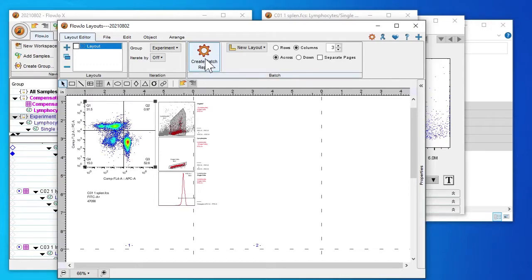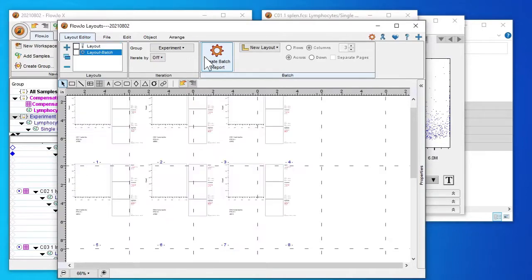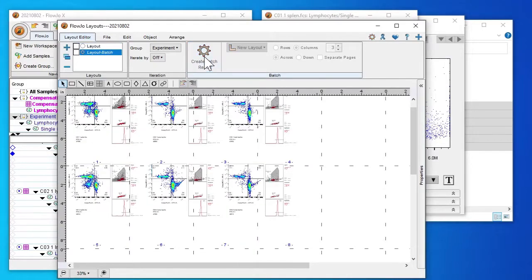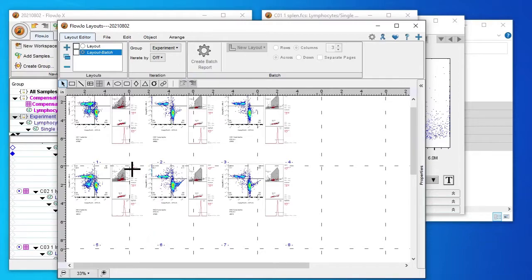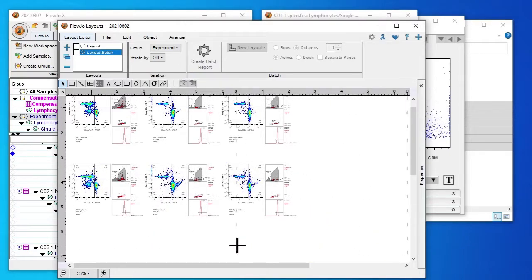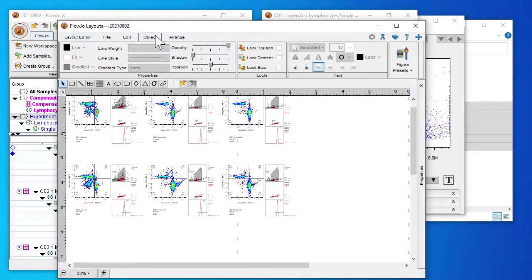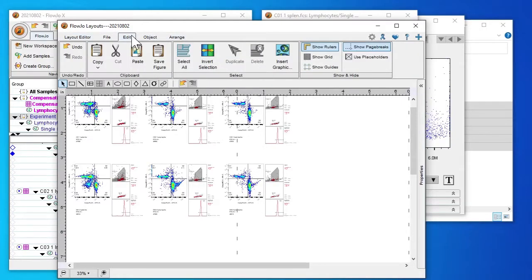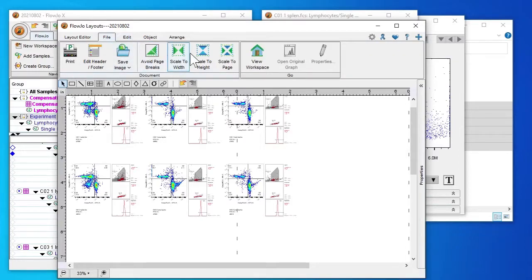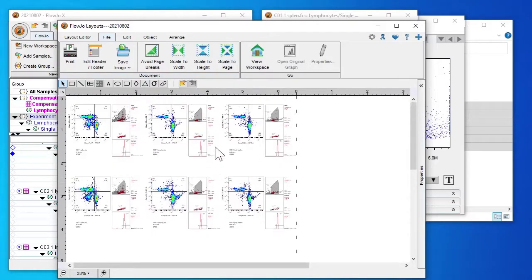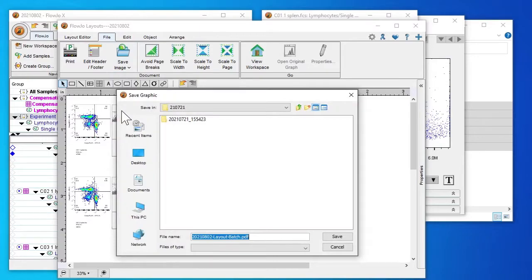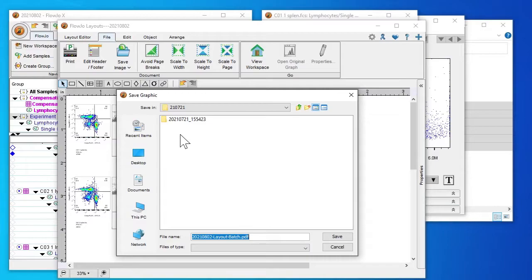I want to create a batch report so that all of our six samples of interest have the same layout. We need to change the page size so that everything fits in. So under file click scale to page. And we're saving and choose a variety of different file formats but I will choose PDF. Set into this folder.